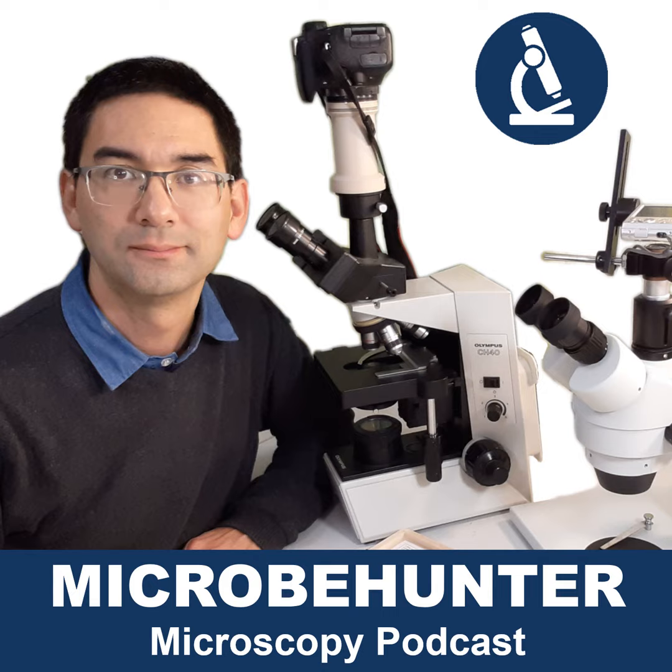Well, of course, what amateur microscopists like to do is natural observation. We collect pond water samples, we put them under the microscope, and we observe the life that's there. It's simply fun seeing things that are there in our environment that we cannot see with our unaided eye. So in that sense, amateur microscopy, or microscopy in general, expands our horizons a little bit. We tend to see the world a little bit differently, through different eyes to a certain extent.